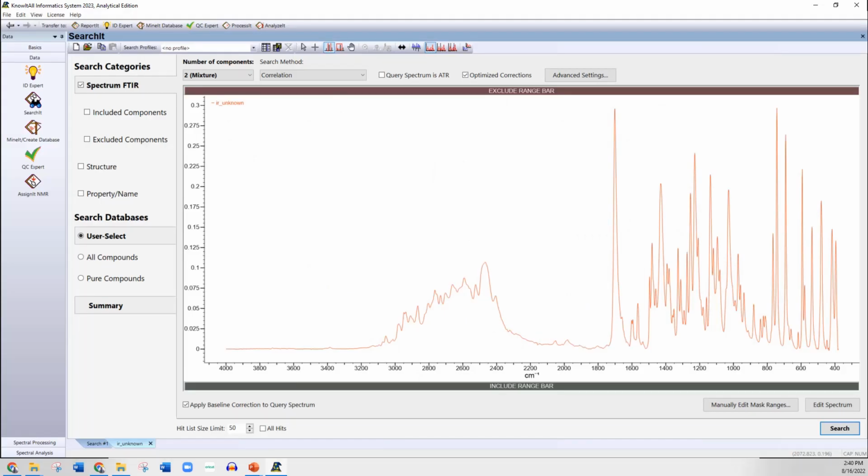But in addition, we do have infrared data for this solid, and here is the infrared spectrum of it. It does somewhat match our proposed structure. We can see this carboethoxy group that's on a carbamate. That's the right frequency for that absorption. We also expect to see some CH and CH2 absorptions in the range of 3,000, but it was strange to see this large lump here between 2,900 down to around 2,400 that wasn't easily explained by the GCMS structure.